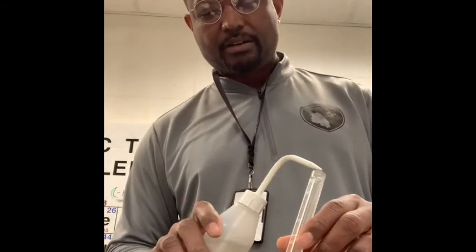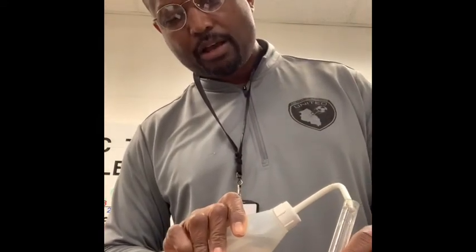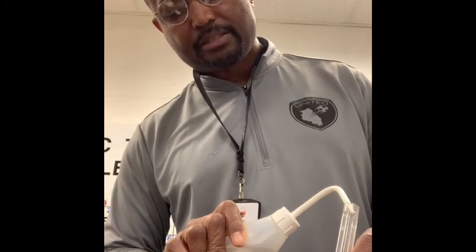So the first step is to add 5 milliliters of our lake water. Again, I have it in a distilled water bottle just because it's easier to manage that way, as I brought it back from the lake. And so there's my 5 milliliters of water.